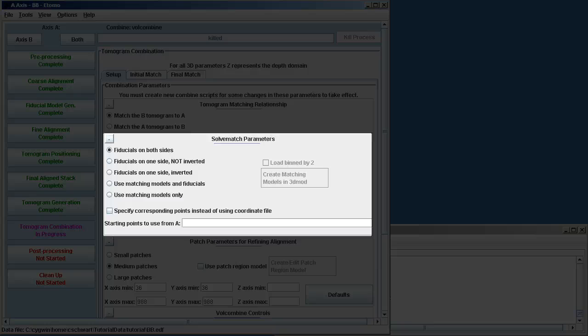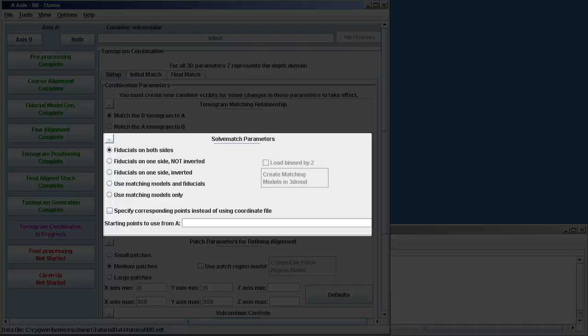Next, we want to know where our fiducials are placed. In this case, the fiducials are on both sides. It's critical that you do not mess up this step because if they really are on one side but you say both sides, you won't get a good combine. So you must get this correct.